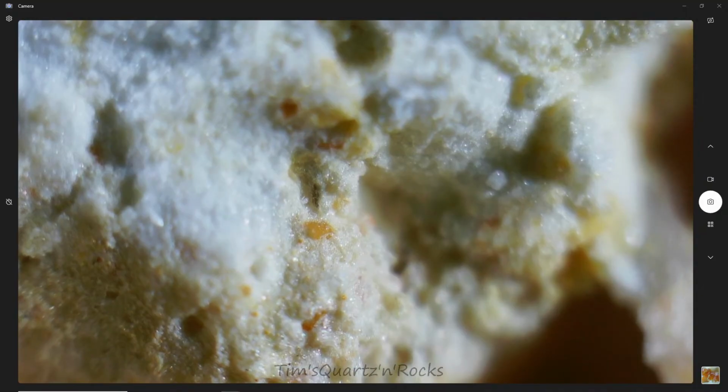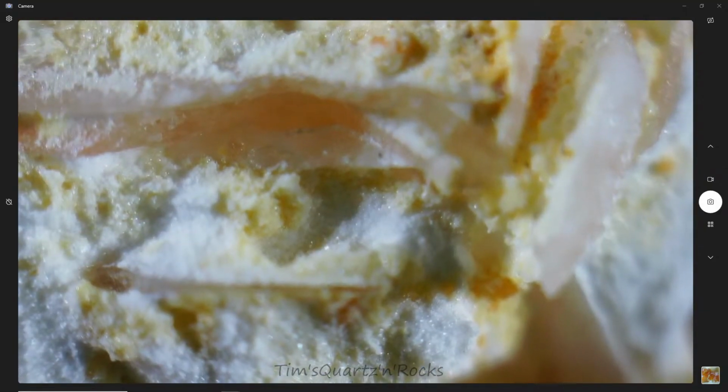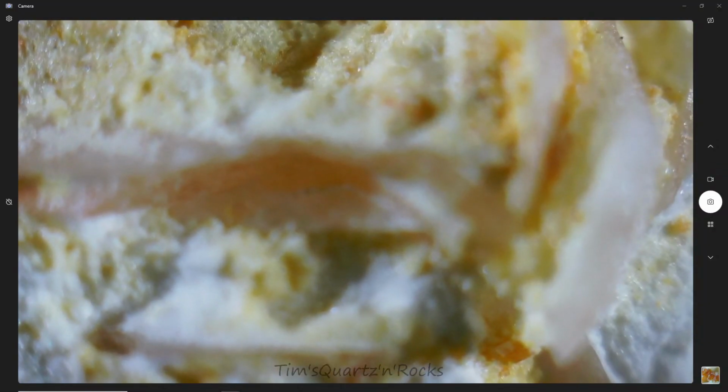And we do still see those tiny pieces, and I think this is probably similar to when you get a rock and it's mostly comprised of, say, quartz. The tiny little particles.